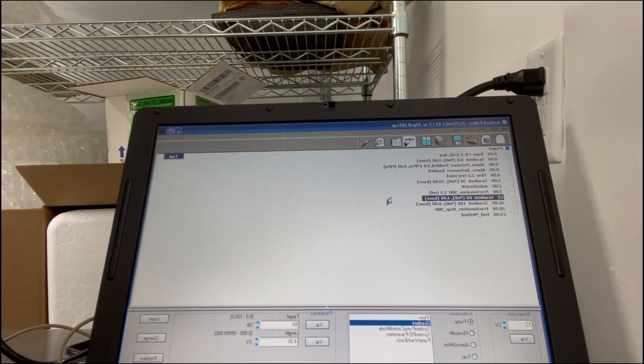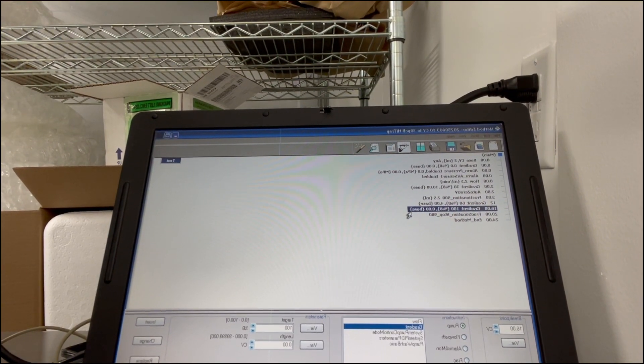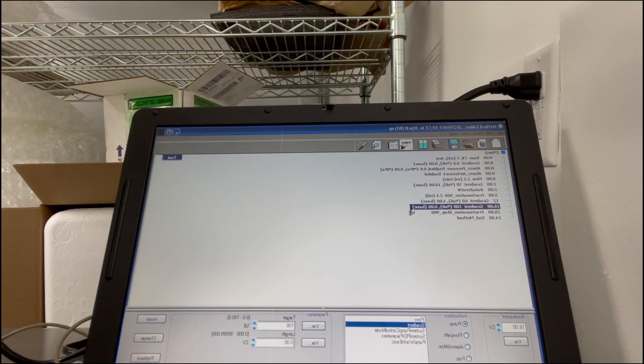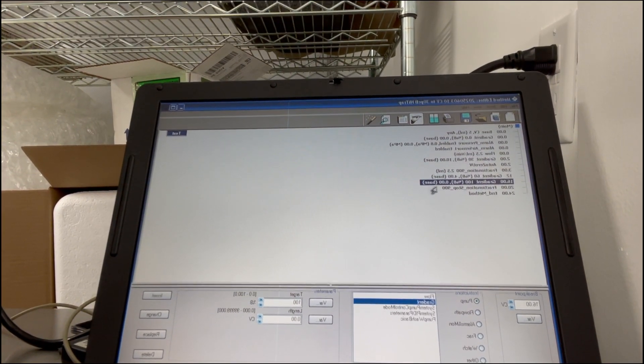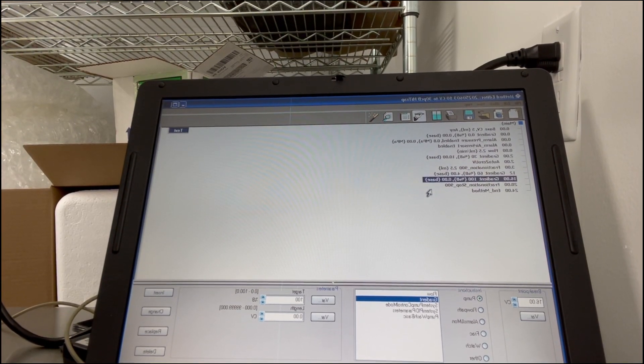That is to elute DNA. And then finally there was a gradient immediately to 100% B and that's because I want to store the column in buffer B. And once this method is done the column is going to be ready to store back in the fridge.